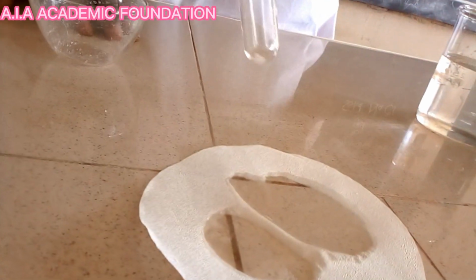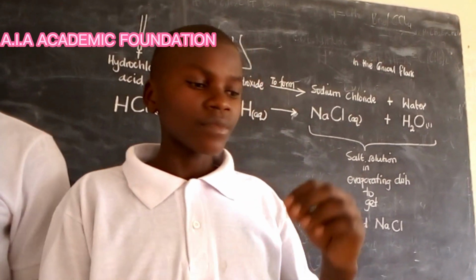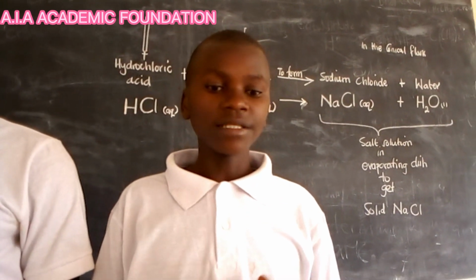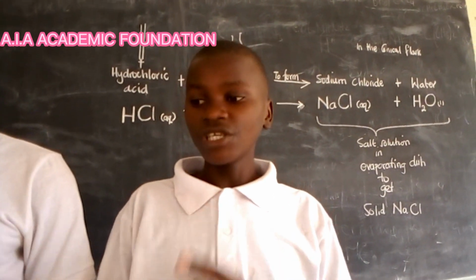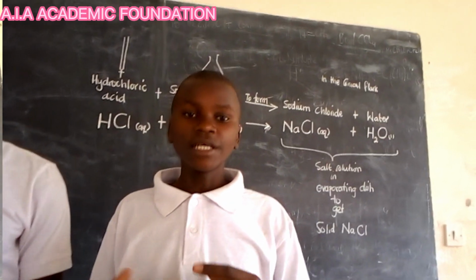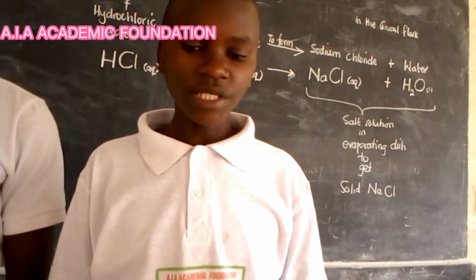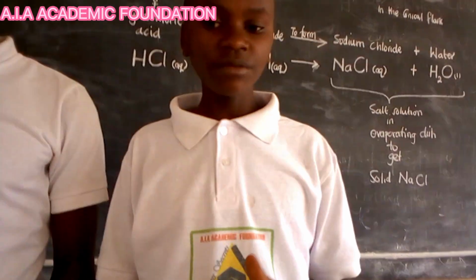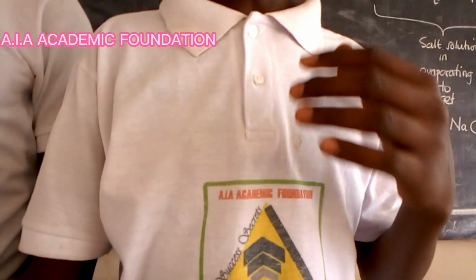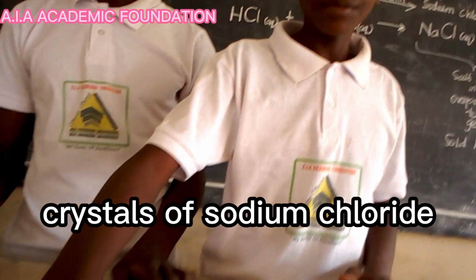So there are two methods that can be used to get the crystals from sodium hydroxide and the acid. You can heat the solution so that the crystals remain in the evaporating dish. So this was the aim of our experiment. The product that we got from the experiment was the crystals of sodium chloride.